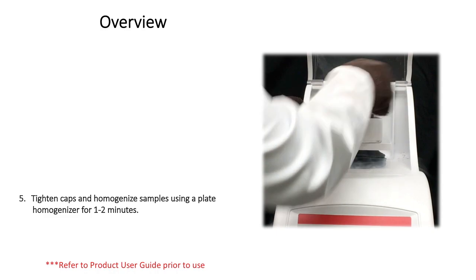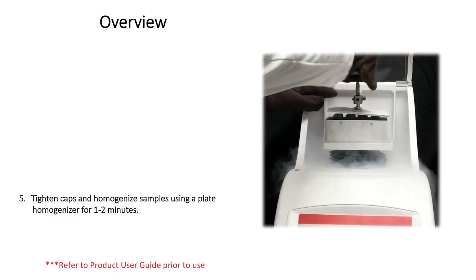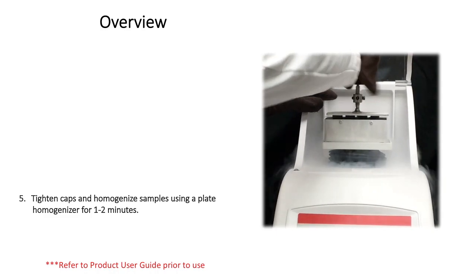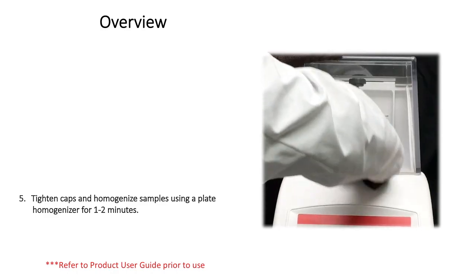Tighten the caps and secure the AC block in a high velocity plate homogenizer. Homogenize samples for 1-2 minutes at 1200-1500 RPM.